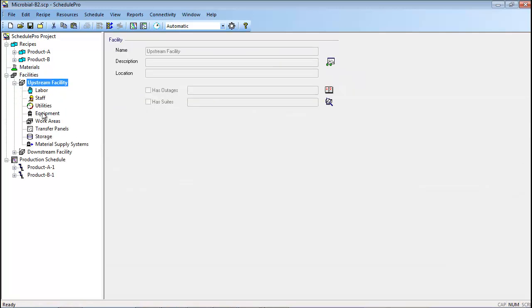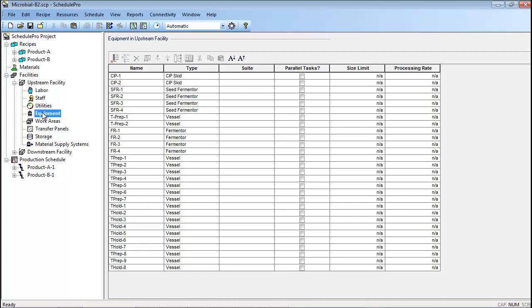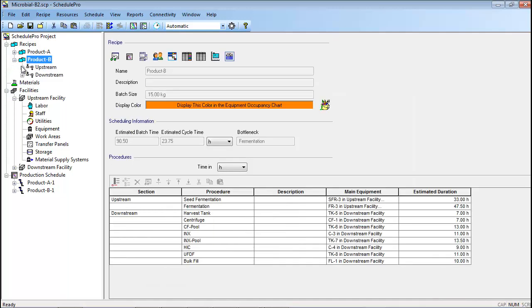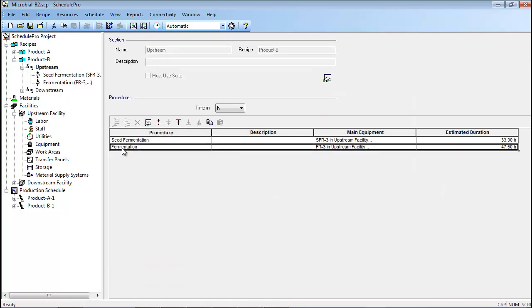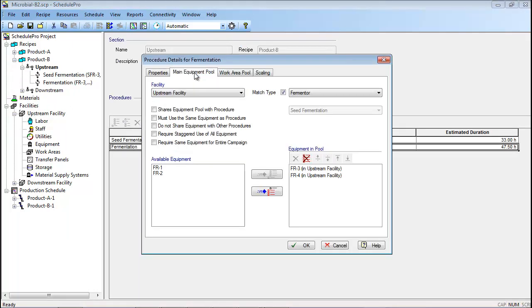First, a duplicate set of equipment should be added for Product B. This requires the addition of two new seed fermenters, SFR3 and SFR4, two new production fermenters, FR3 and FR4, etc. Next, the new equipment items were assigned to the Product B recipe by selecting the relevant procedures in the Product B recipe and updating the equipment specifications for their main equipment pools. For instance, the main equipment pool for the fermentation procedure of the Product B recipe was updated to contain fermenters FR3 and FR4 rather than fermenters FR1 and FR2.